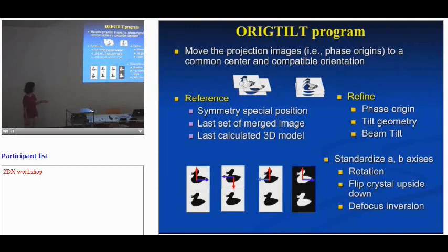And then the third situation is that you have over-focused images collected accidentally, which are not distinguishable, especially at very low contrast, from the crystal images. Then you may need to actually invert the sign of your CTF correction. So these are things that you may have to do.